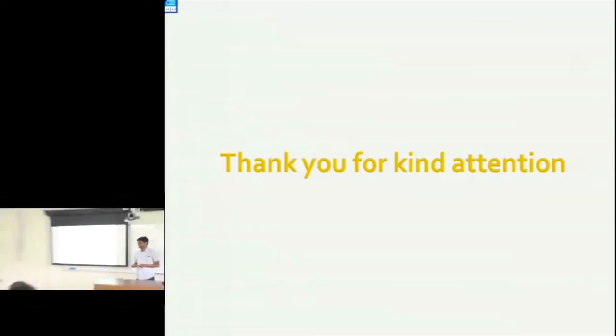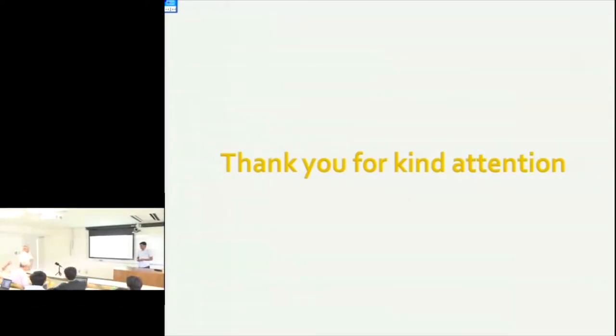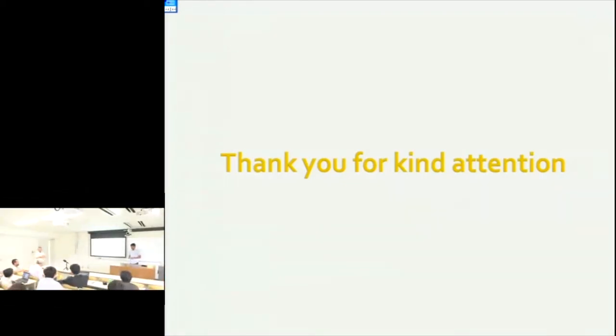Give me suggestion to minimize the error. I saw with your spectra data, yes, baseline. You did some portion, but not fully. I will present at Thursday group meeting, so you cannot show this baseline effect removing today.